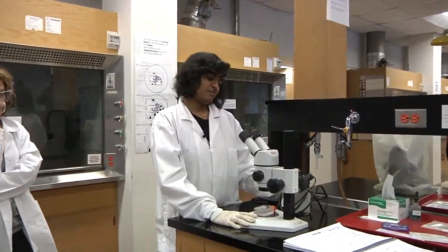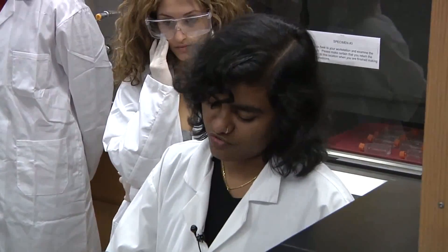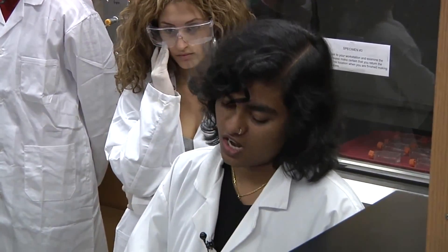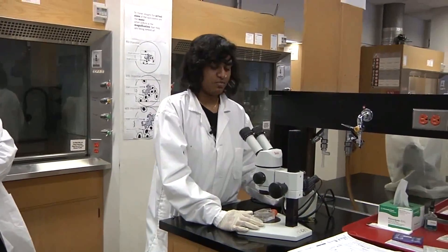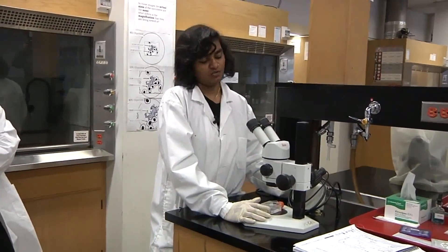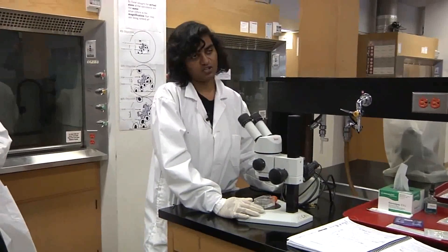This is a dissecting microscope, and most of these specimens are found in fresh lake water. They are actually food for fishes, and they are present in PFA. PFA is paraformaldehyde, 4% PFA, and it's very carcinogenic.